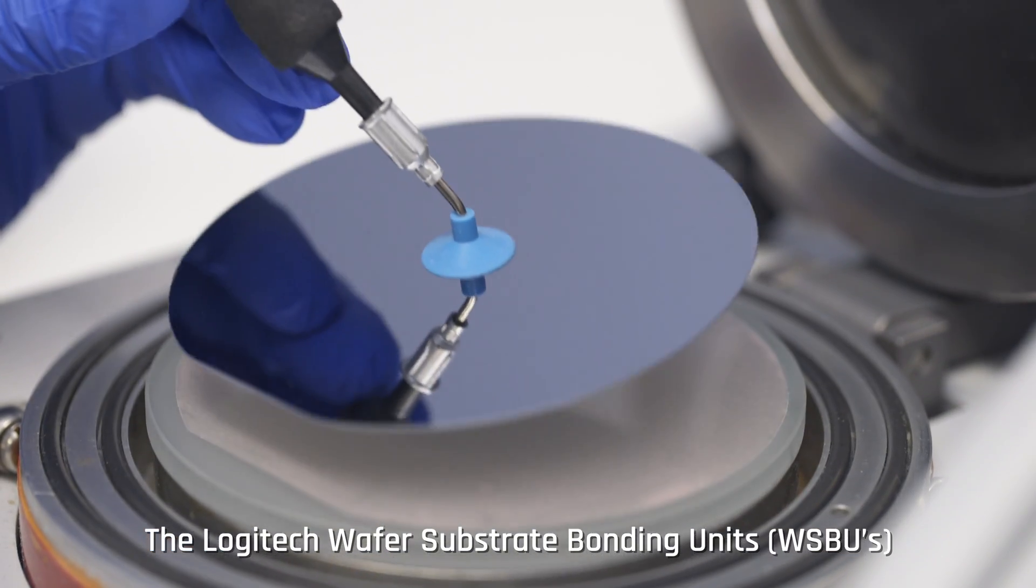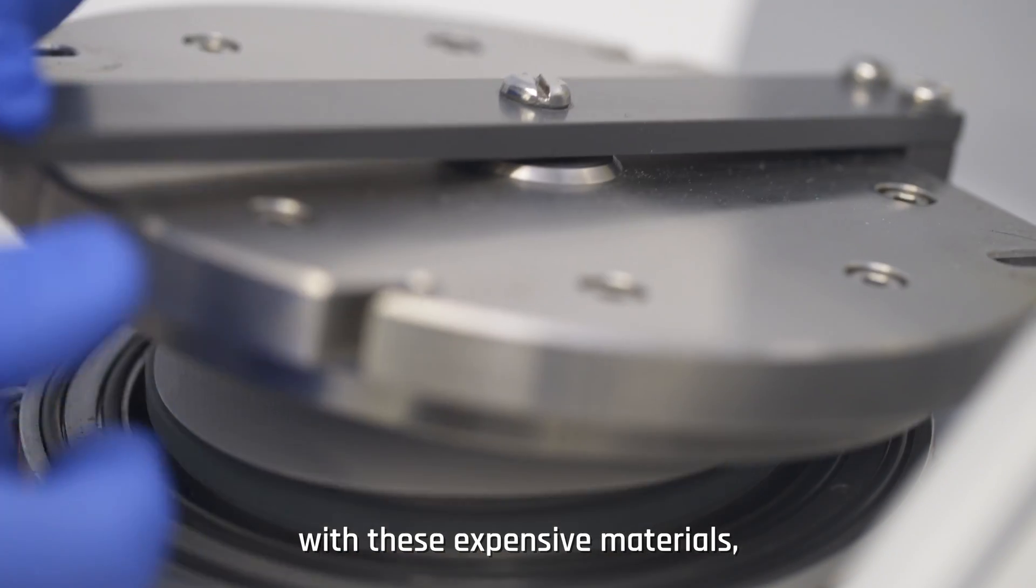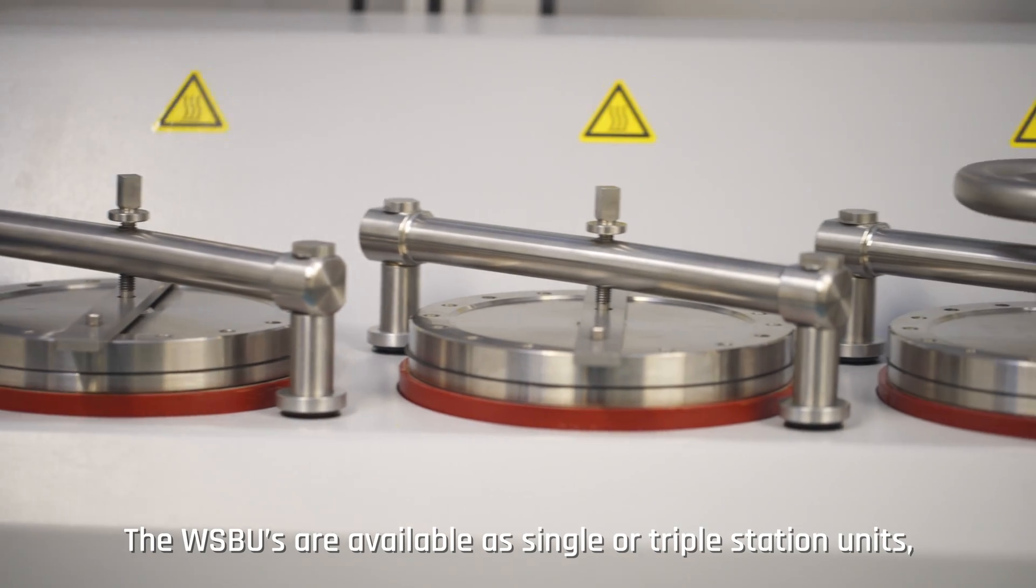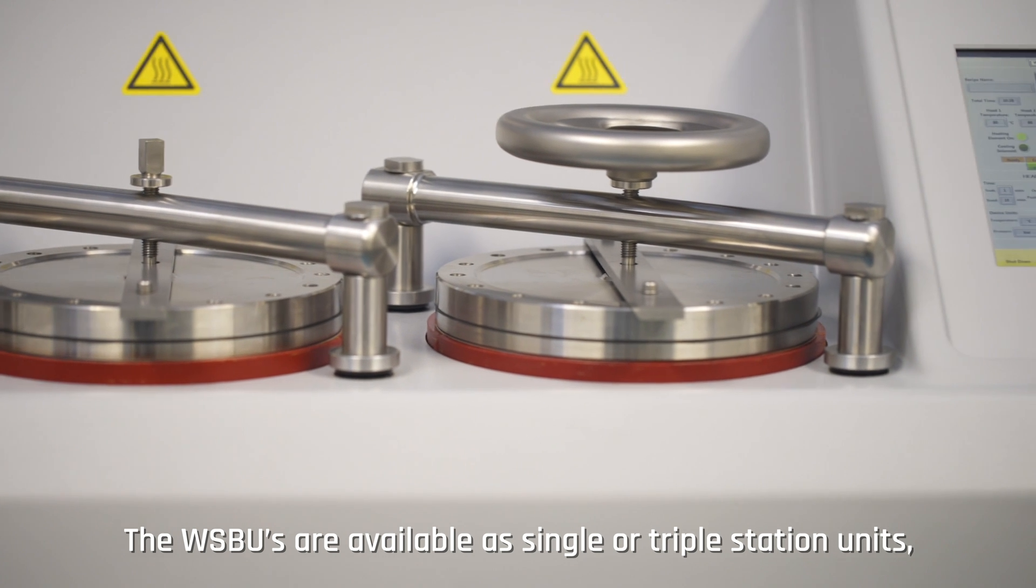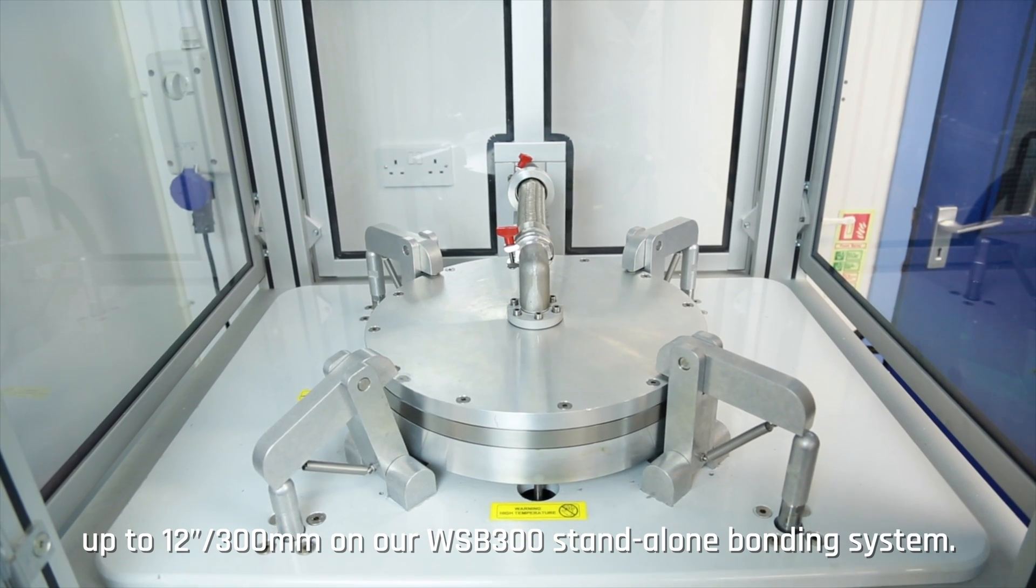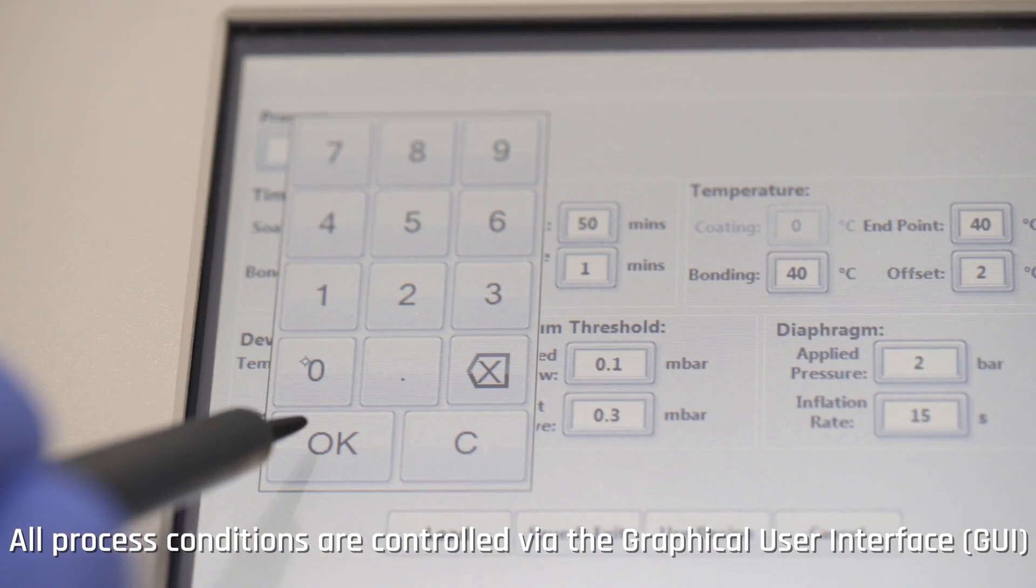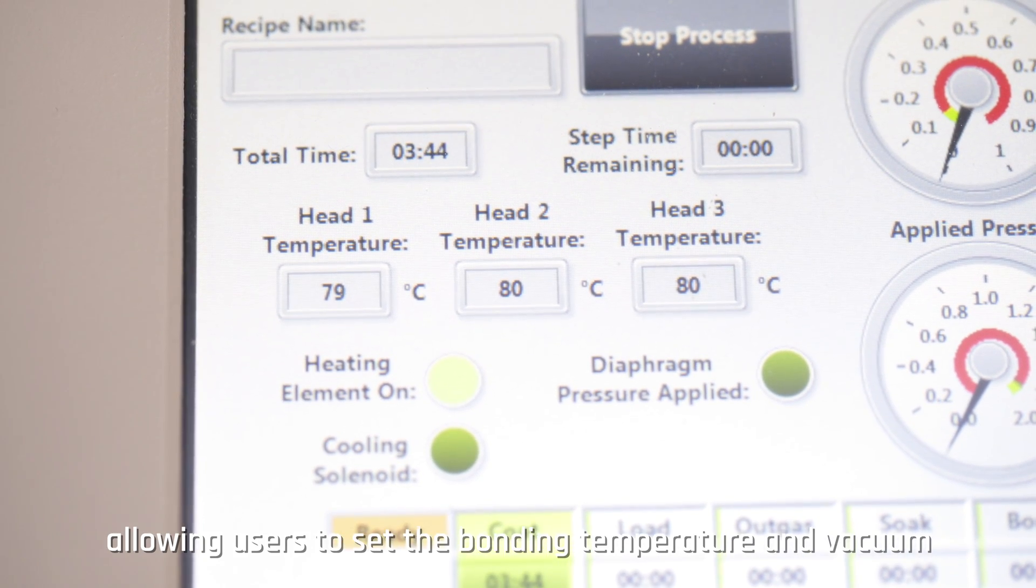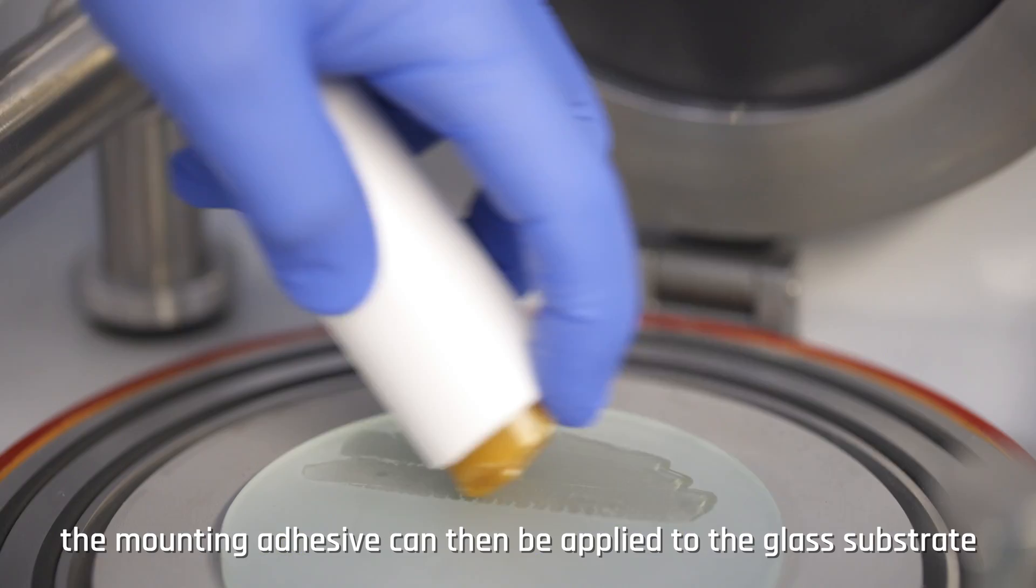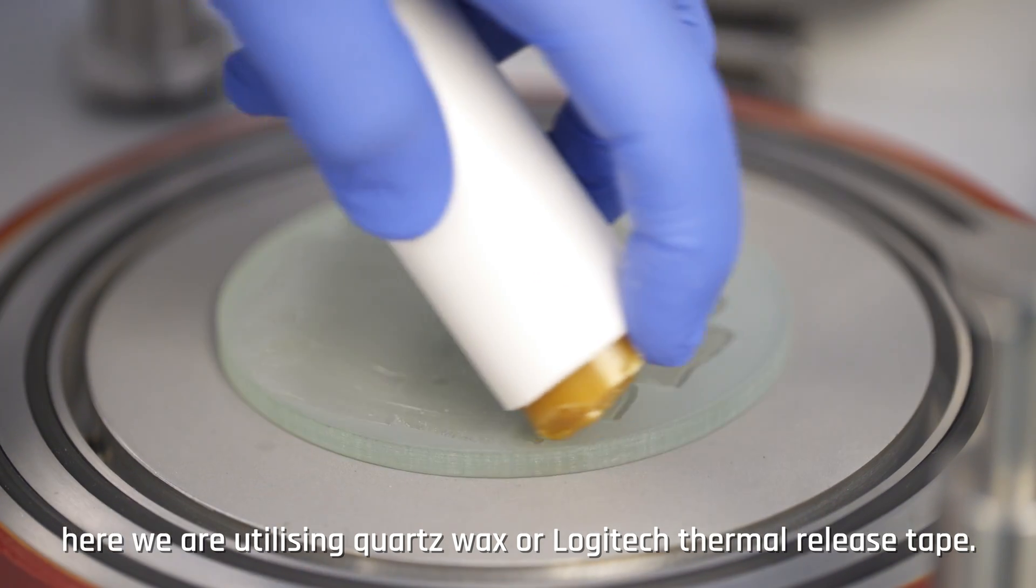The Logitech wafer substrate bonding units have been designed specifically for the bonding of fragile semiconductor wafers. These units are designed to minimize breakage with these expensive materials whilst retaining the highest quality of sample yield. The WSB units are available as single or triple station units with a wafer process capacity of up to 4"/100mm. All process conditions are controlled by the graphical user interface, allowing users to set the bonding temperature and vacuum required for the specific sample. Once the bonding temperature has been set and reached, the mounting adhesive can then be applied to the glass substrate. Here we are utilizing quartz wax or Logitech thermal release tape.